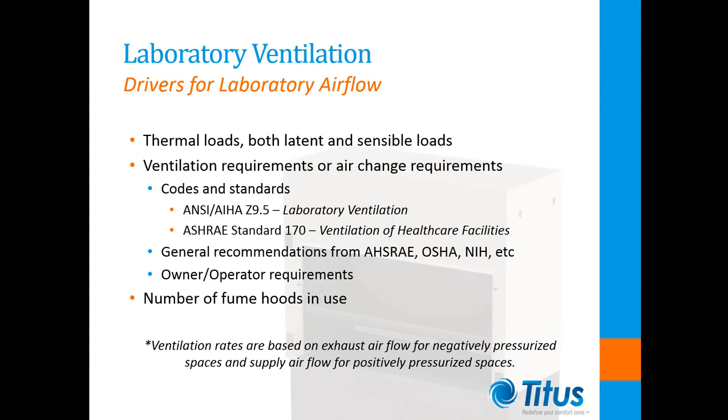The most widely used of these is ANSI standard Z9.5. It is a laboratory ventilation standard established by the American Industrial Hygiene Association, and it recognizes that ventilation is a tool that can be used to control exposure to contaminants, but it should not be solely relied upon as a means of control and removal of contaminants, as it is generally ineffective. Instead, contaminants should be controlled at the source of generation, for example, within a fume hood.